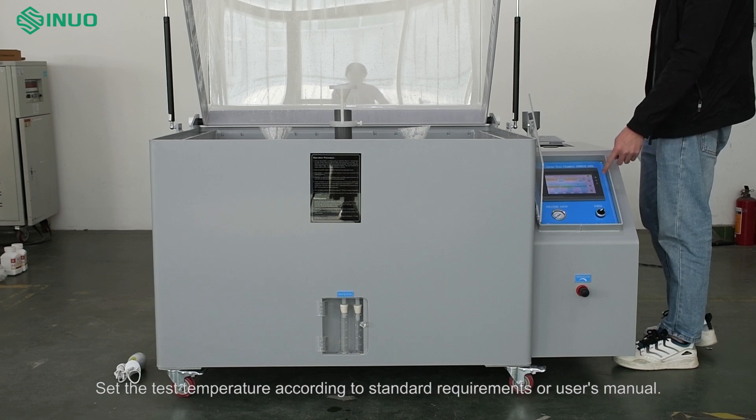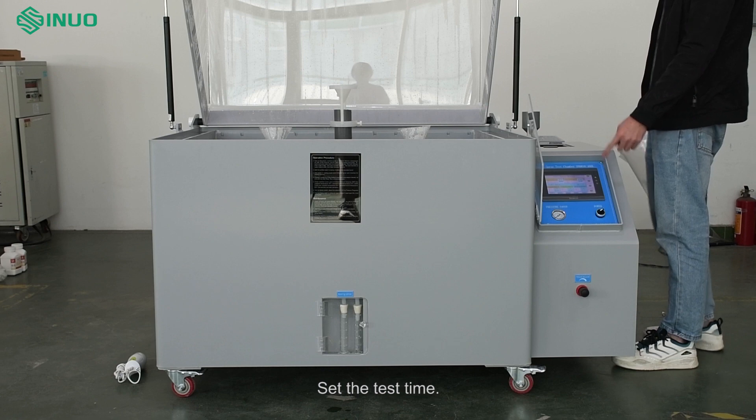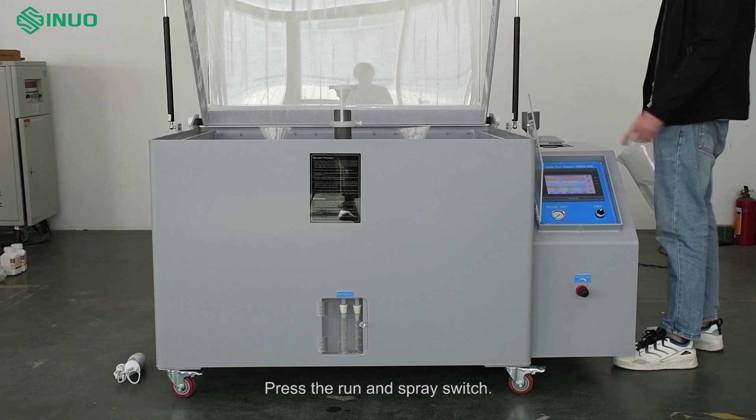Set the test temperature according to standard requirements or the user's manual. Set the test time, then press the run and spray switch.